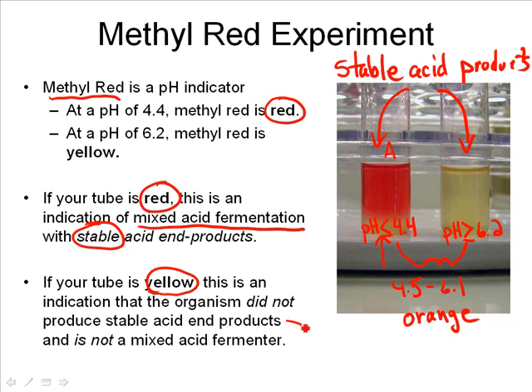Those acid end products were neutralized. And when those acid products are neutralized, the pH is going to start to approach a more neutral pH.